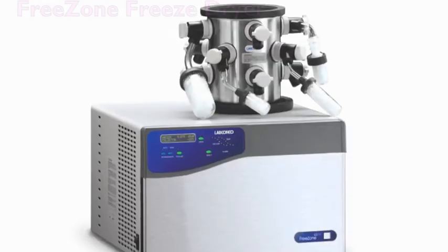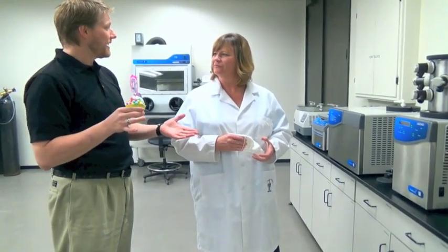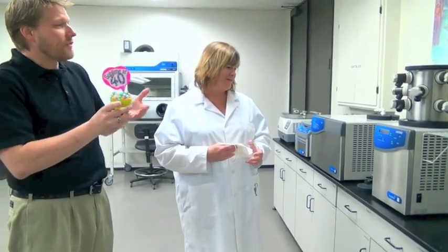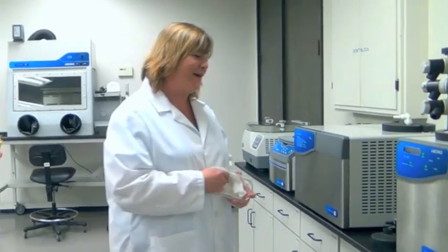So guess who's 40? The Lab Conco freeze dryer! You're kidding. So what I was wondering is if you could help me give it a cupcake for its 40th birthday. We'll just lyophilize one — it'll be great. You're kind of my freeze-dry expert, so you have to show me what to do. What's the first step?